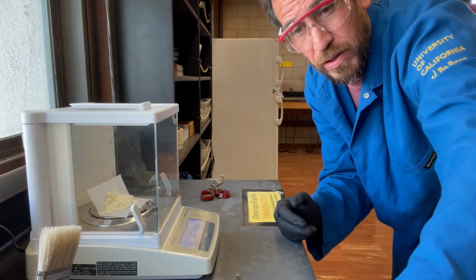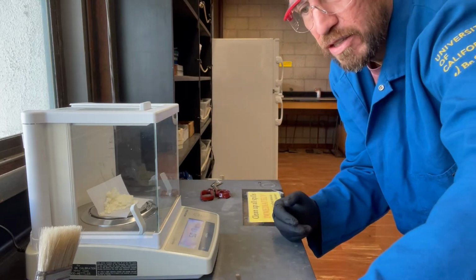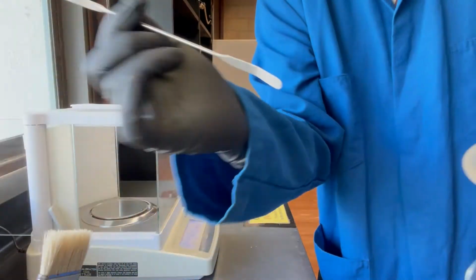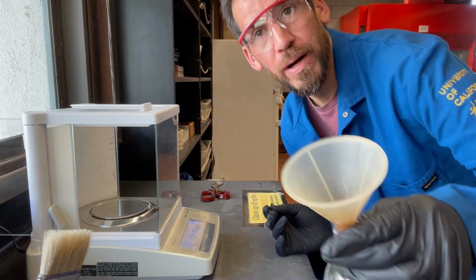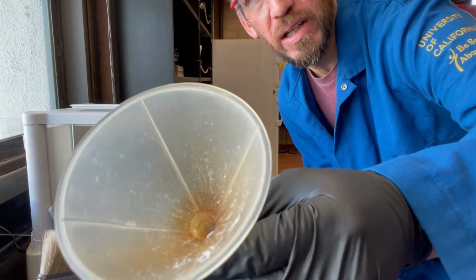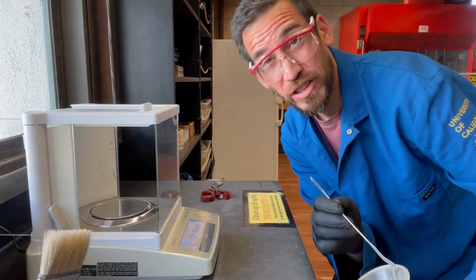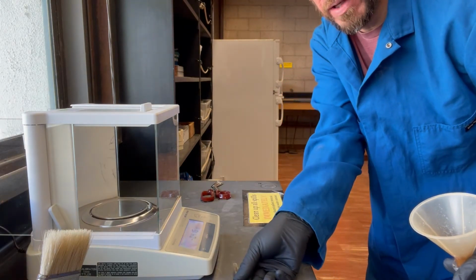5.017 grams. So I'm gonna go ahead and place that inside of this round bottom, hopefully not spilling everywhere, but then I'll put it in the oven. Okay. Not a spill in sight, but there is a little bit of solid material kind of stuck on here. It's a little staticky. I can't get that off. So yeah, it's all good though.